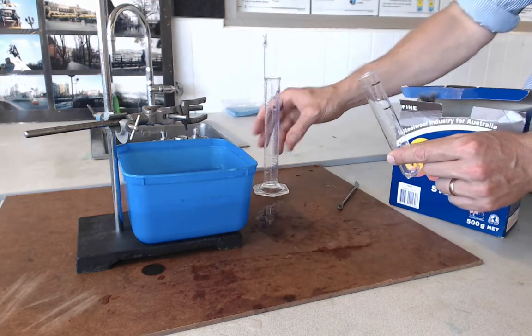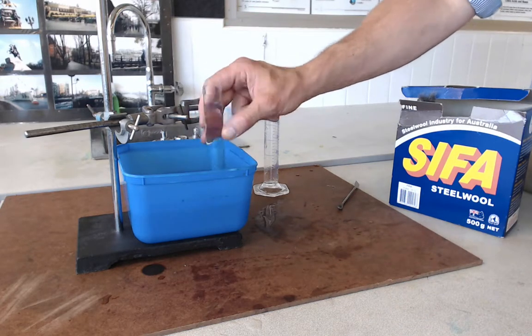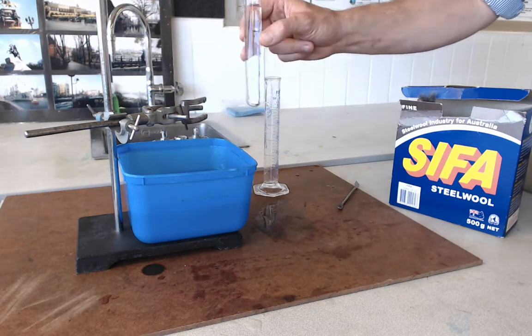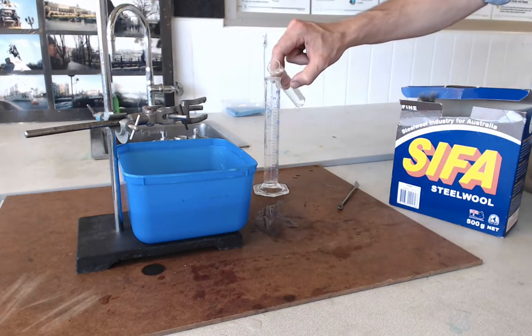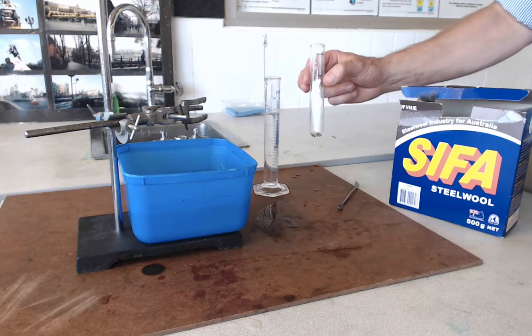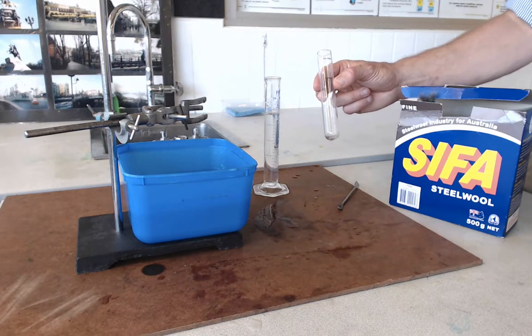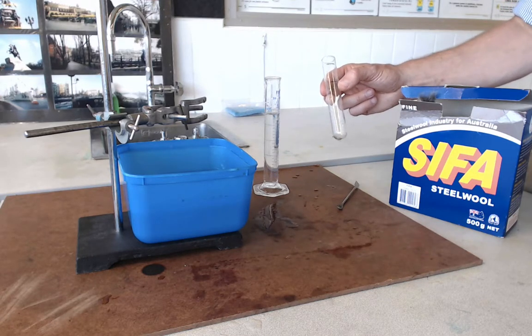I'm going to empty that measuring cylinder out and fill up my tube again, but this time to the other mark. Remember, it doesn't matter what order you do these in — I started with the lower mark so I'm doing the higher mark now. This is going to tell me how much air there was in the tube at the start of the experiment, so again I'm going to pour that water into my measuring cylinder. I'll read off the measuring cylinder what volume of air was there at the start, and I'll know how much air was in there and how much oxygen got used up. I can then fill these values in on my table.